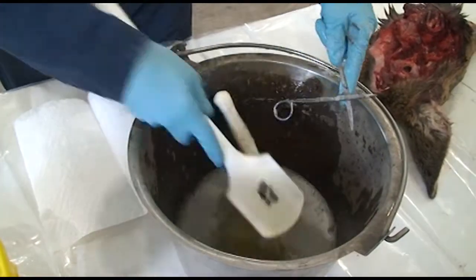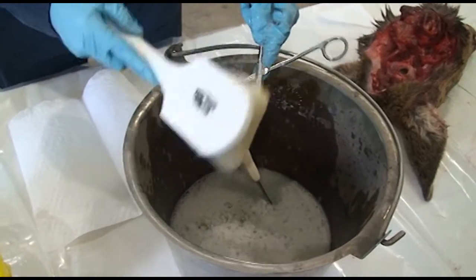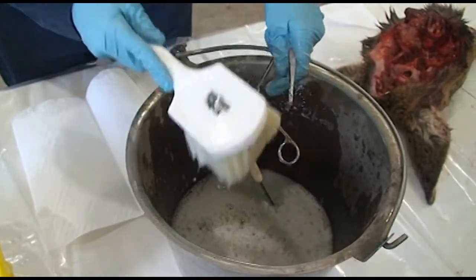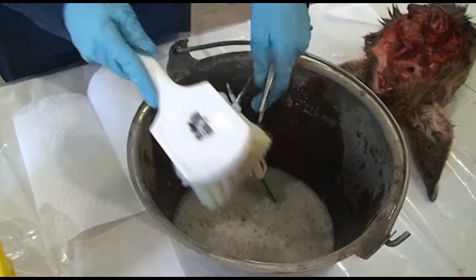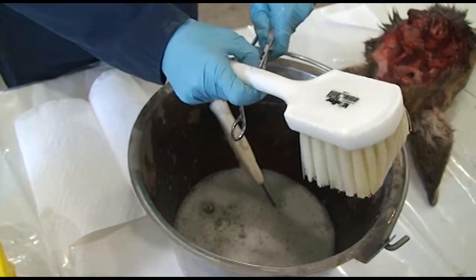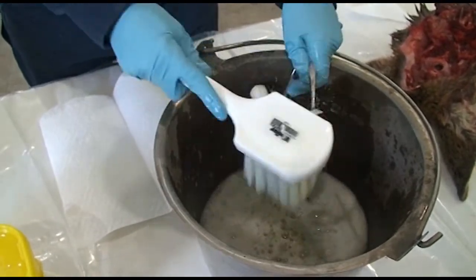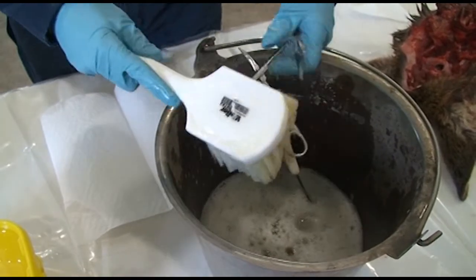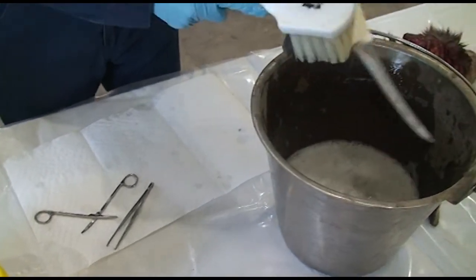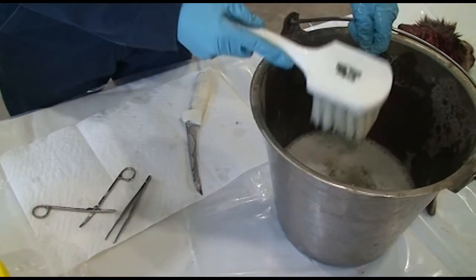You want to make sure you open up your scissors and get any blood and tissue that may have collected clean good out of those, and also out of the inside of the rat tooth forceps. You want to clean any blood out of those good too. But not least our sampling spoon.